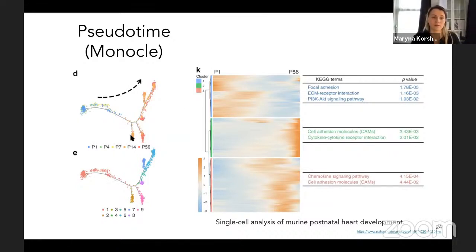You might also have a lot of undivided cells or progenitors, where even on the snapshot you can see that these cells form other cell types. So by using pseudotime, you align your data into different developmental trajectories.